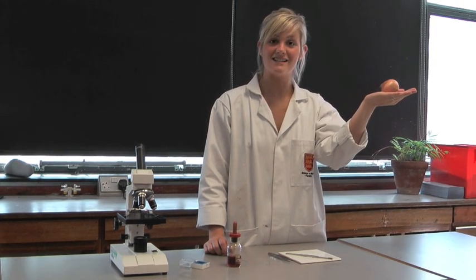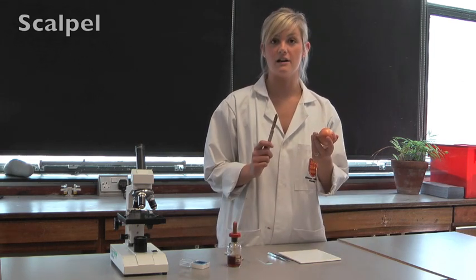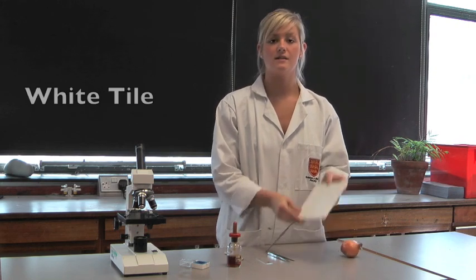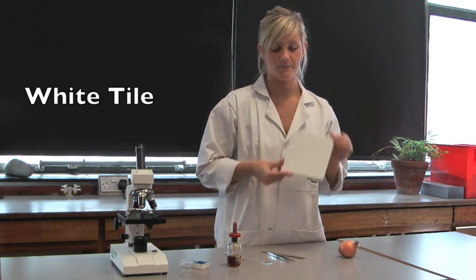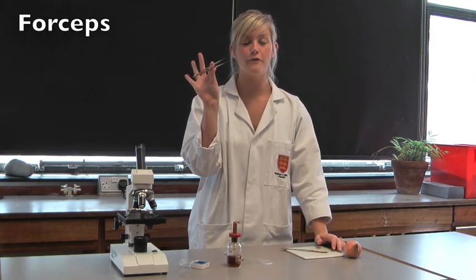This is what you'll need for your risk assessment for the onion slide. Firstly, you're going to need to cut up your onion using a scalpel and a white tile. Once you've cut up your onion and taken out the piece that you need, you'll need to pick it up with your forceps.